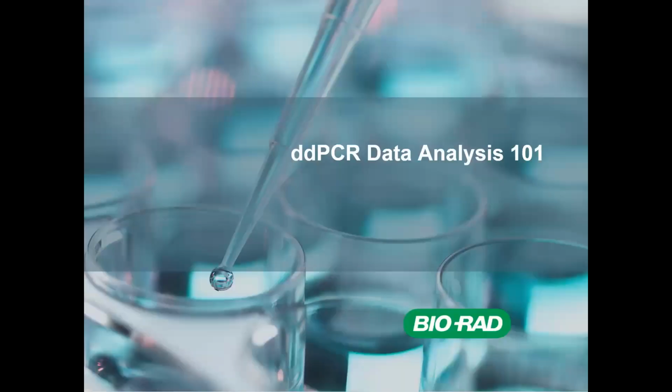Okay, so how do we actually analyze data? We're going to just very quickly go through data analysis, and to set this up for talking about COVID-19.